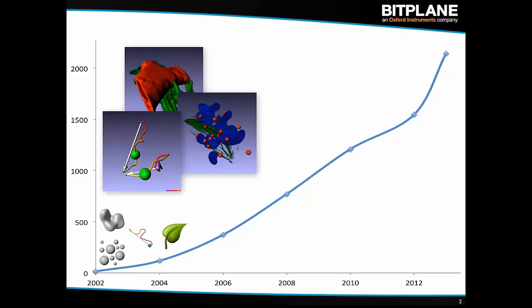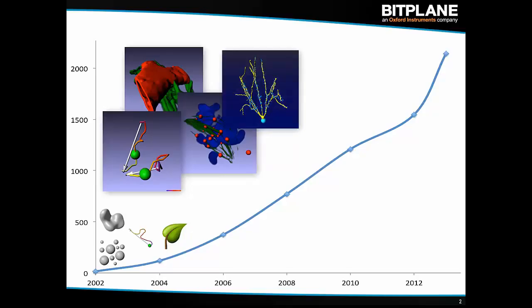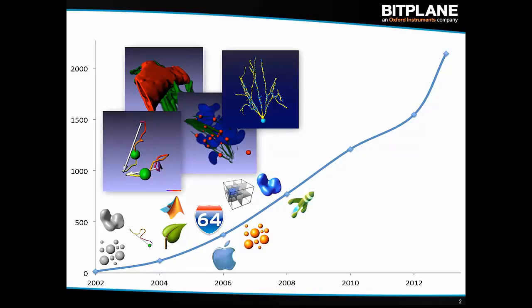And over the years, we moved from looking at image visualization alone, so just rendering 3D scenes using the computer graphics that were available at the time, to where we are now, which starts to go into the more experiment management and hypothesis testing. And the progression you can see there, we started with visualization, added gradually more and more image analysis tools. Our first attempt to add batch analysis was over here in 2008. We have now killed that completely and provided a completely new workflow for batch analysis.